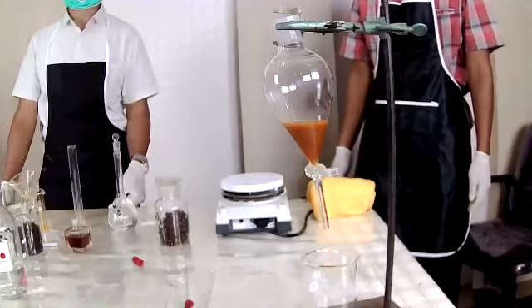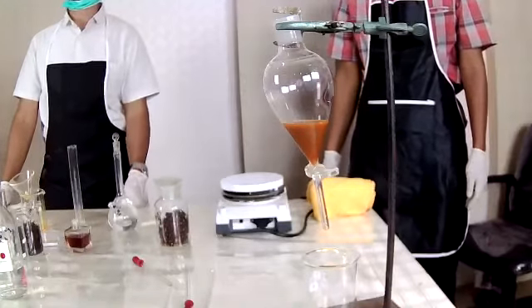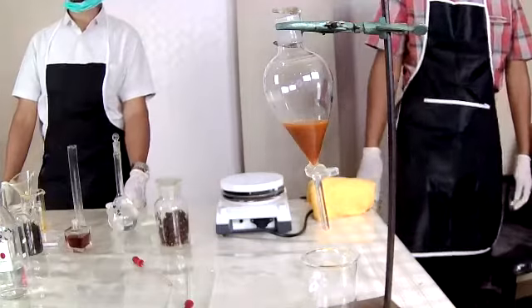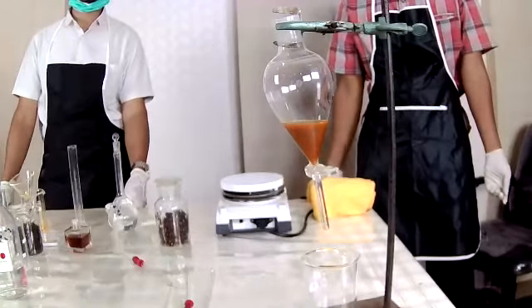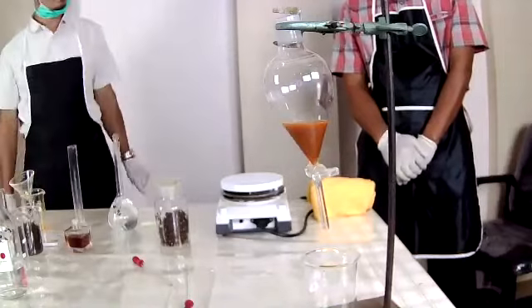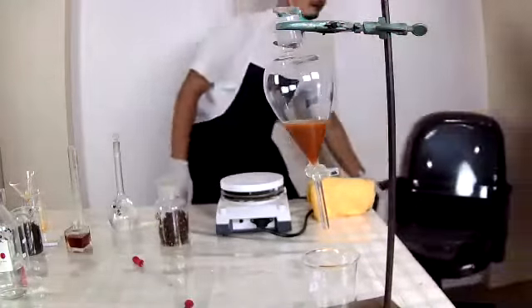You can also use the ether compound, but we do not recommend it because it's toxic, and also it's combustible. Although it's also easy if you are used to dealing with this chemical process, or if you're a chemist, then maybe you can try that method as well.